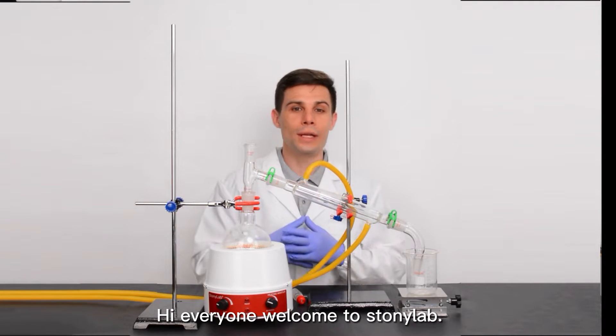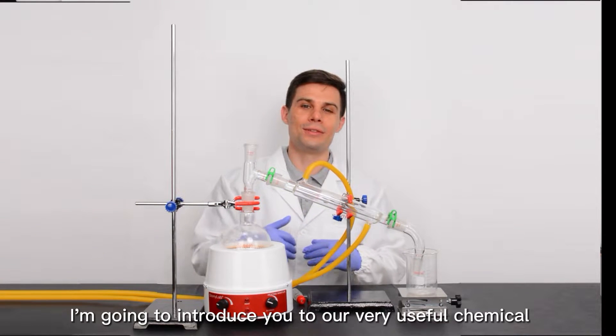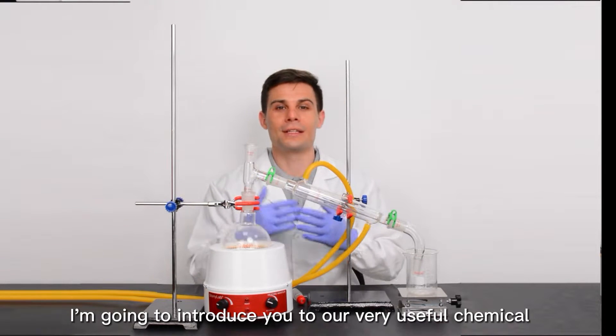Hi everyone! Welcome to StonyLab. Today I'm going to introduce you to our very useful chemical experimental tool.